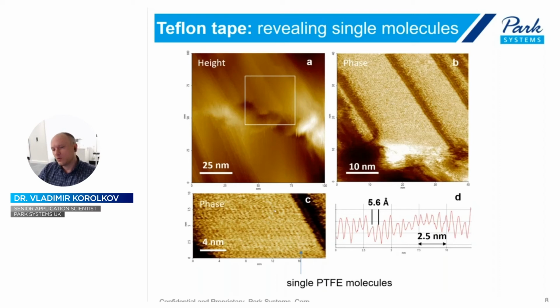That's exactly what we saw live. And the beauty of the AFM images is that you can take measurements. You can measure distances between those lines, and that is critical because it's not the pretty image you want to take. You want actually to get some numbers, and in this instance, these numbers are distances.